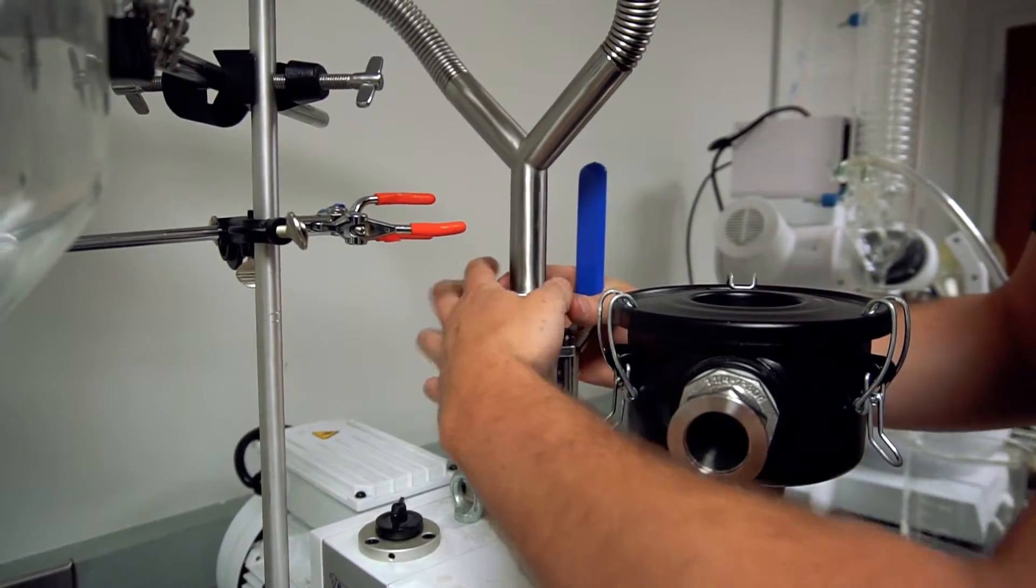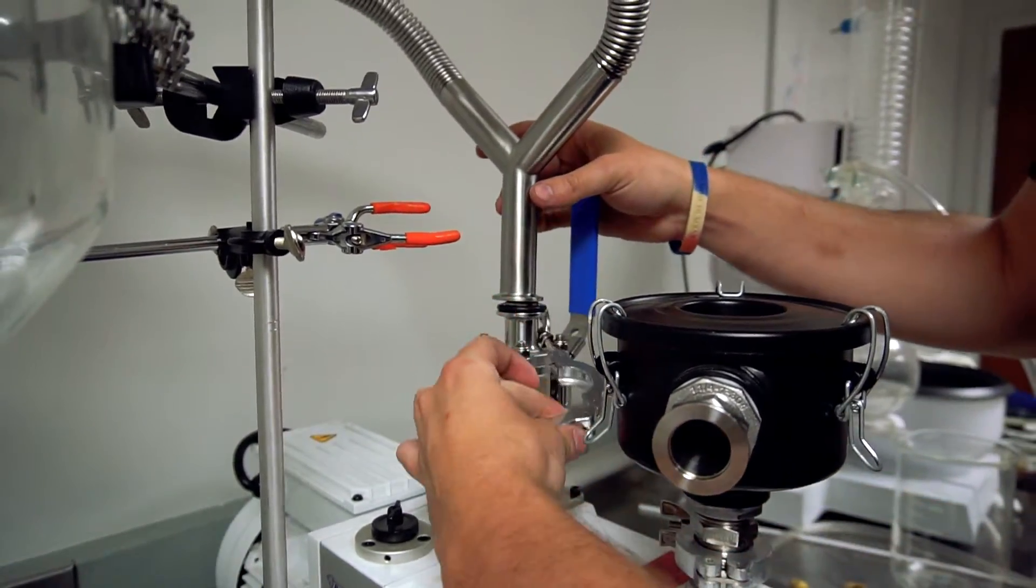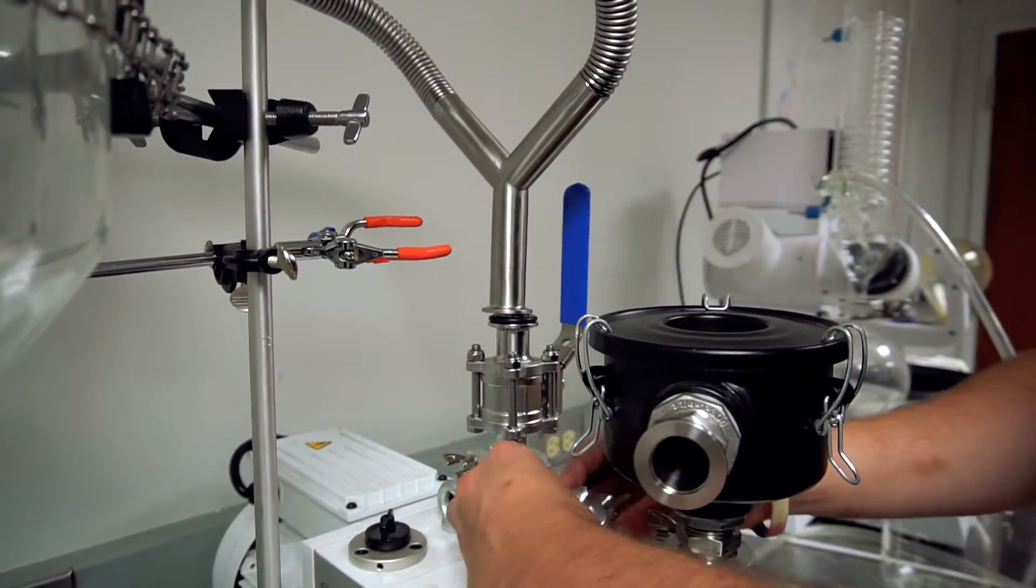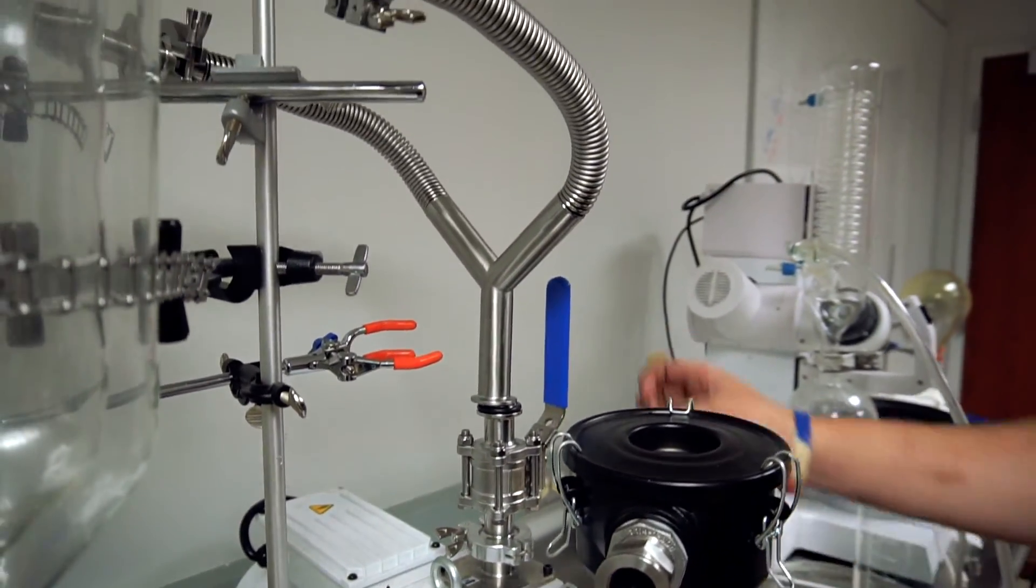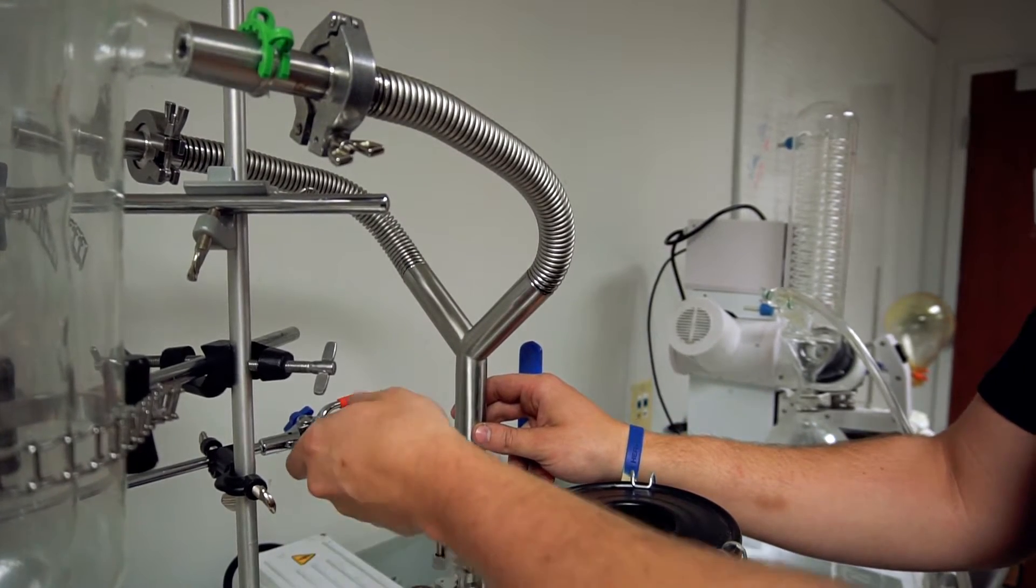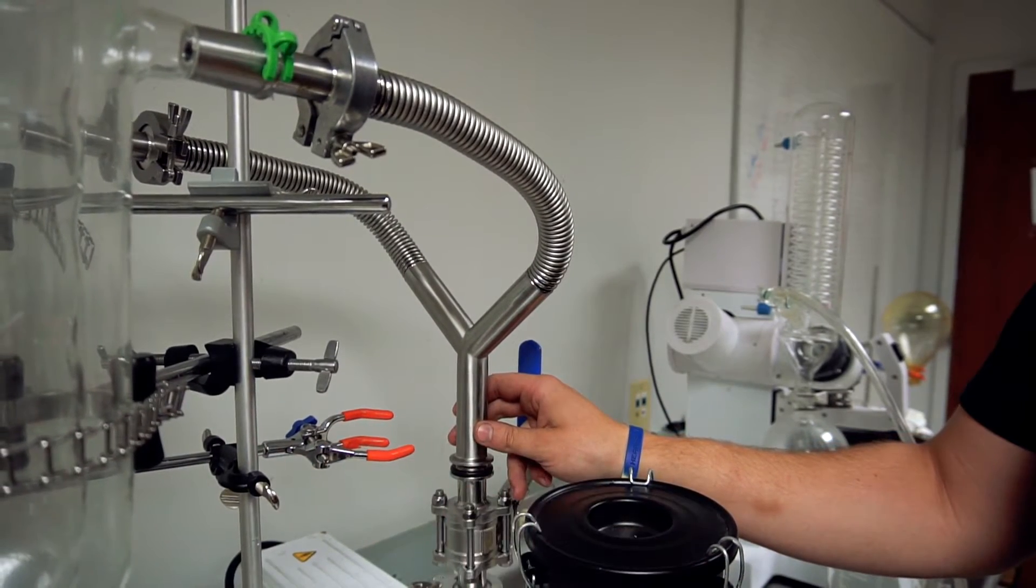But after I take these clamps off, you can see that the Y bellows kind of stays in place, showing that it's not putting a lot of strain on the glass. It's mostly just held in place for extra safety in case it gets bumped or something like that.